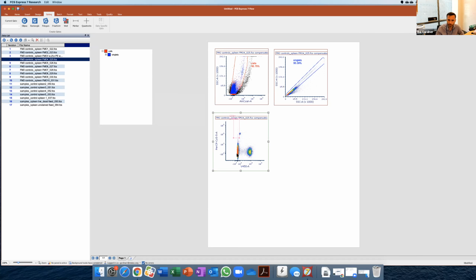Actually, if you're not comfortable, and this is something that we can also look at, scaling. If you're not very comfortable because there's a lot of space here, and you want to see this in a more logarithmic way, there are ways to do this.